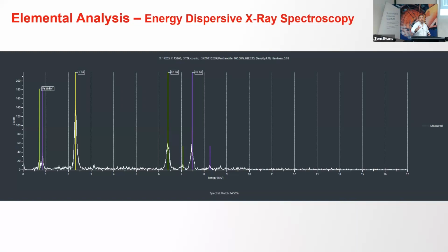And we can map those elements using a relative concentration method, which is a kind of semi-quantitative technique. We don't call it quantification because of the amount of noise in the spectrum. It has a big error margin. So it's more like a semi-quantitative, or we call it a relative concentration method. We can use this to map where our elements are present, independently of the mineral identification.